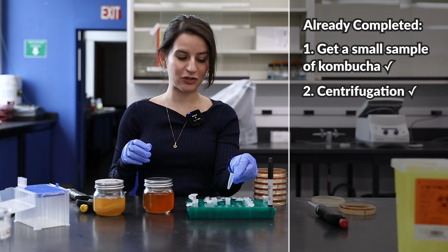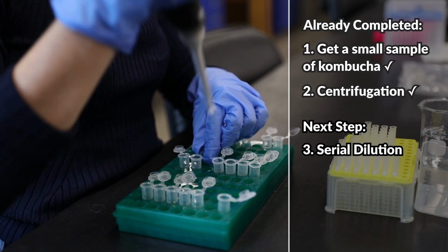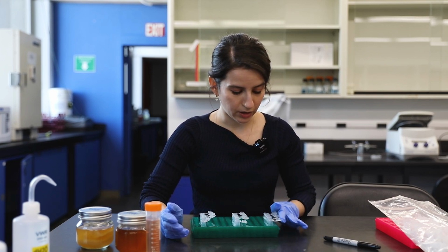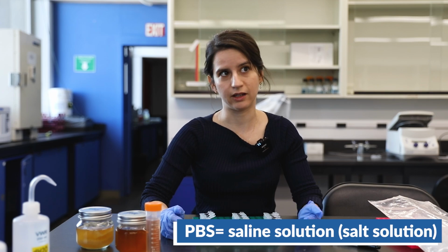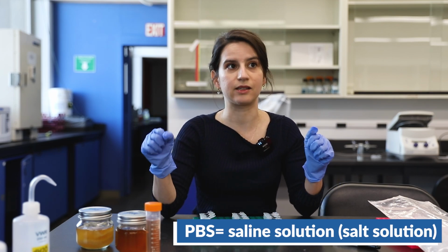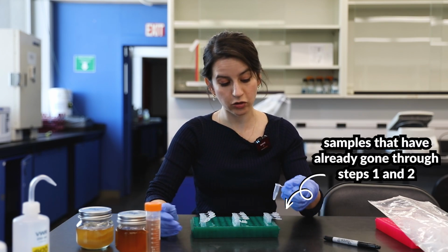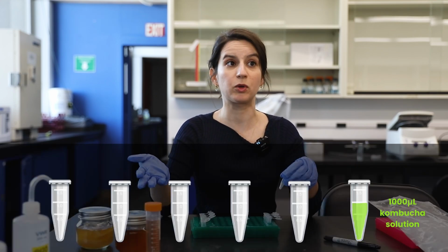The next step is to dilute the sample through serial dilution. Whenever you do any kind of dilution, you're always diluting the culture, whatever the microbes are, into a liquid. In this case, I'm going to use PBS, which is just buffered saline, a salt solution, and that helps the cells stay intact and not burst when they get added to it. These tubes are 10 to the 0 solution, so it's basically just pure culture.